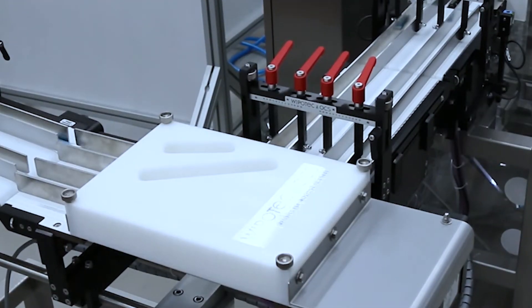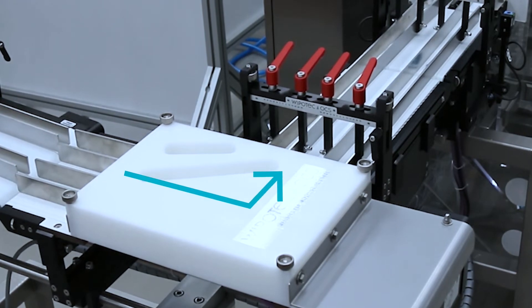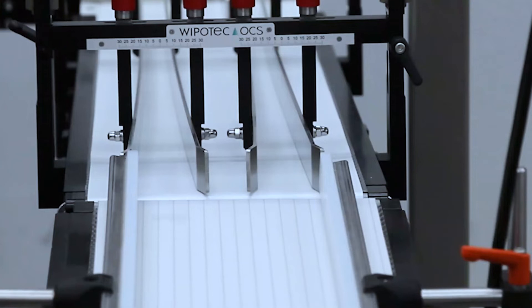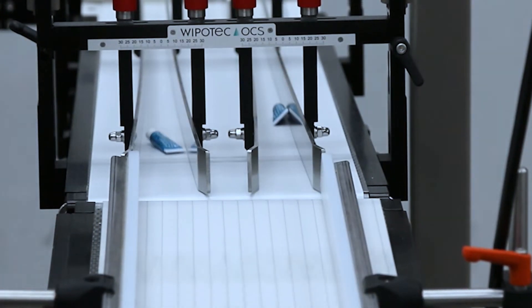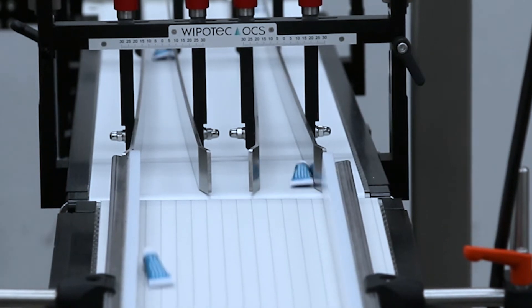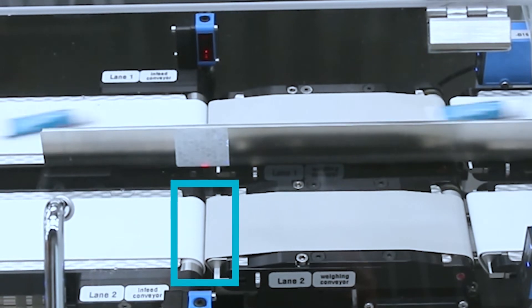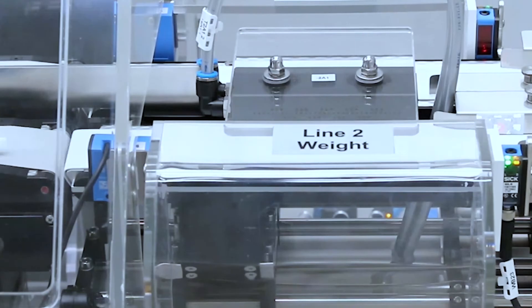A speciality in the infeed situation: on request of the customer we turn the tubes by a 90-degree angle. After that, we ensure the right distance so that products are nicely singled. This machine also has a very special weighing conveyor and a very dedicated rejection system.